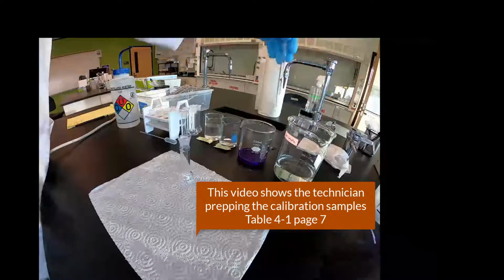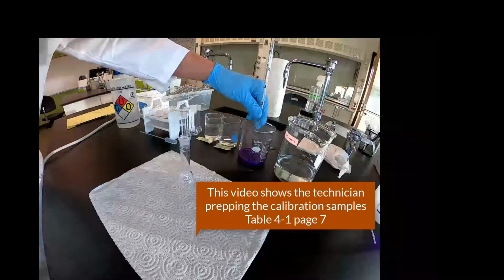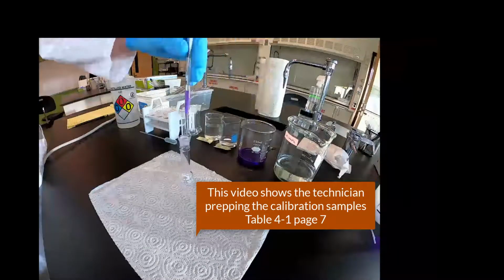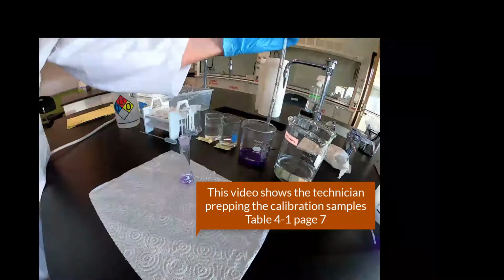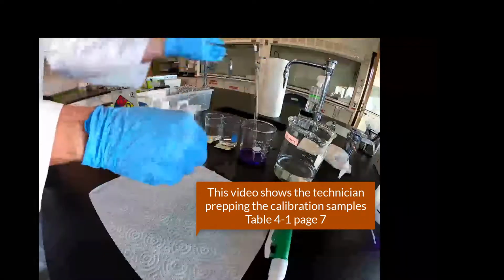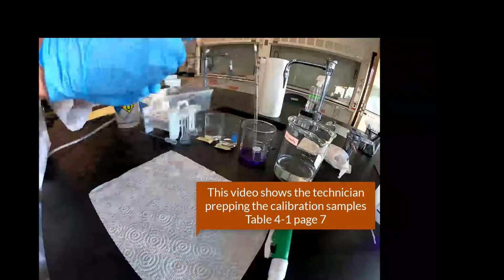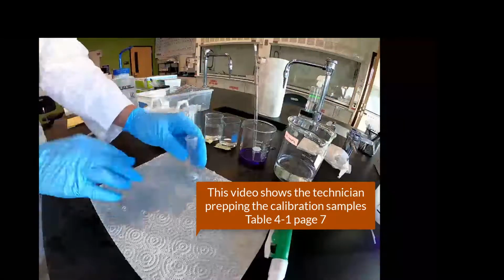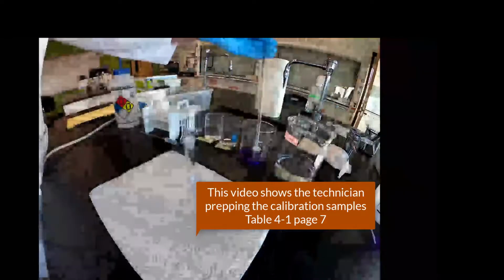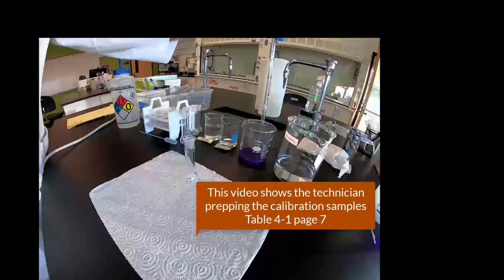All right. So now in the next step, what the technician would want to do is rinse out the volumetric flask. And they're going to make a mistake here and see if you can identify the mistake. So they're wanting to rinse out the flask, and it's a flask in which you dilute, and they prepped it by putting a little of the mother solution and twirling it around and then dumping it into the waste container, and that was a mistake. What is the mistake they made? Okay, we'll fast forward past this and move to the next step.